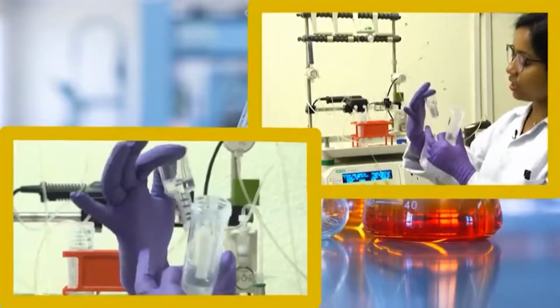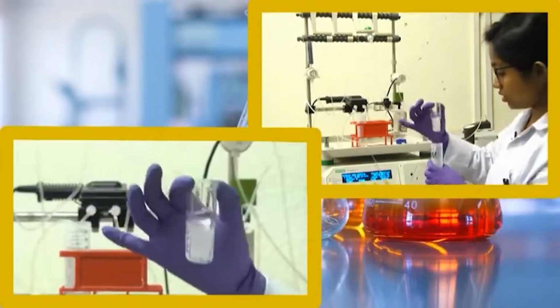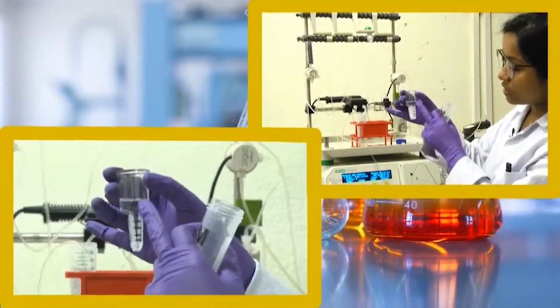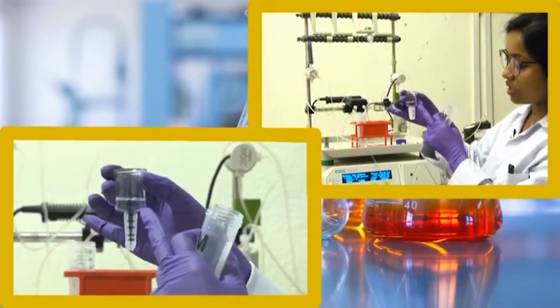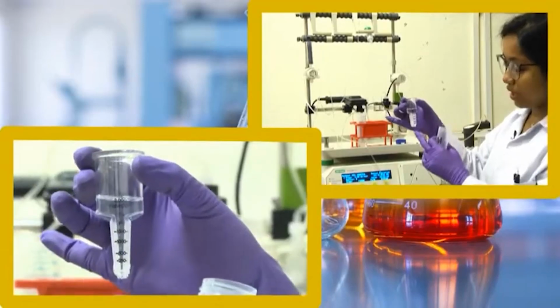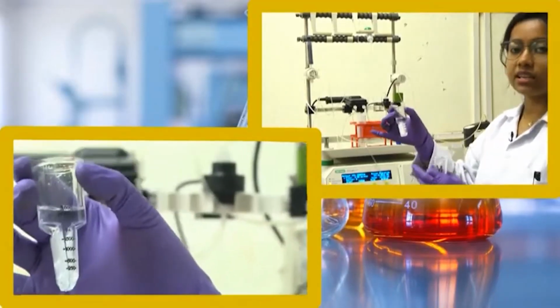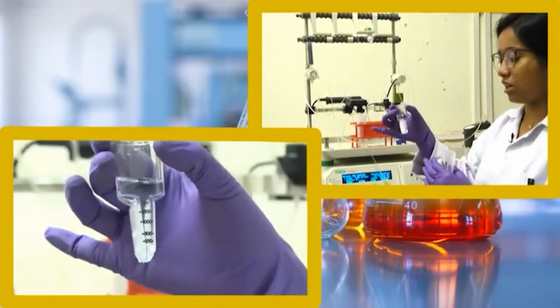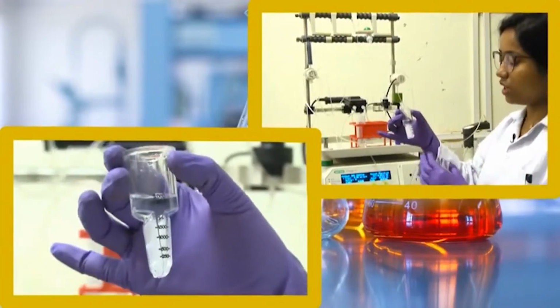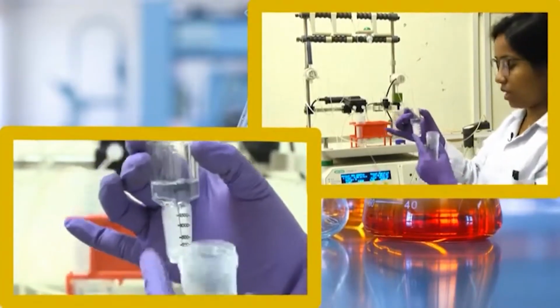It has a cutoff of 3000 Dalton. You can see 3000 MWCO written here, molecular weight cutoff. This particular membrane will let out anything that is below 3 kilodalton. So, any small molecules or proteins that are below 3 kilodalton will come out through this membrane.